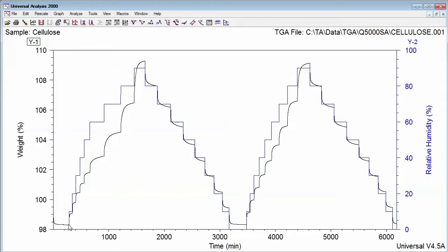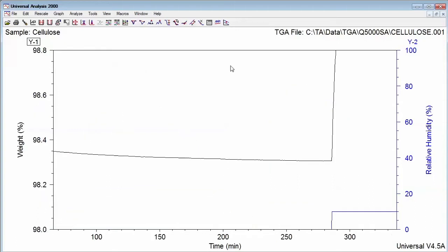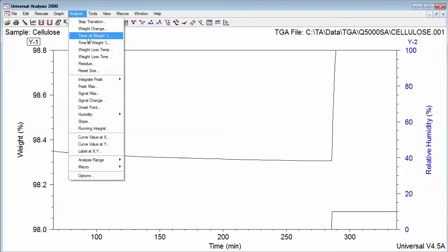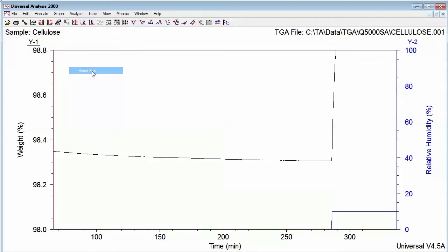Since the sample was initially dried at room temperature and 0% RH, I need to now reset the initial sample mass to the dry mass as weight loss has occurred. To do this, zoom into the drying step, select Analyze, Reset Size, and then choose a data point at the end of the drying step.